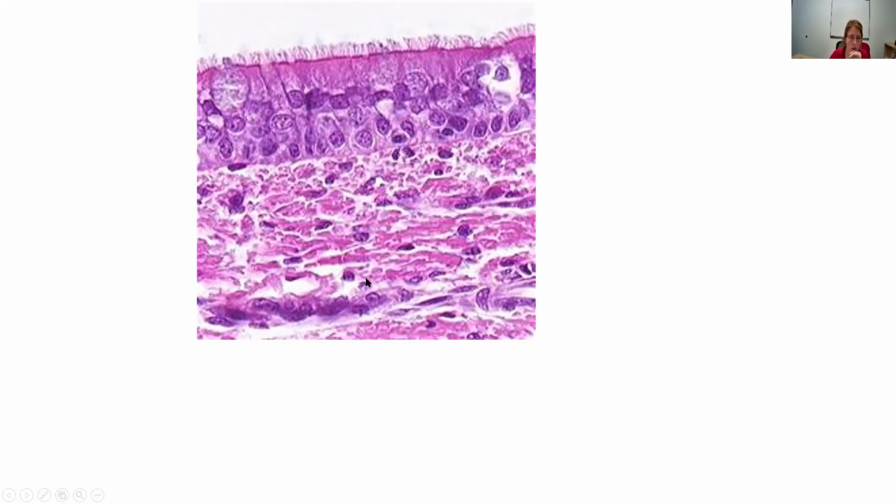Down here, it can't be epithelium because I don't see an edge. I don't think it's muscle because I don't see anything that looks like the muscular tissue. If it was skeletal or cardiac, it would be striated, and the smooth muscle just doesn't look like this mess. So I look at it and I see, oh, there's a cell right here and there's a cell right here and there's some wavy stuff. Those wavy things to me look like collagen fibers.